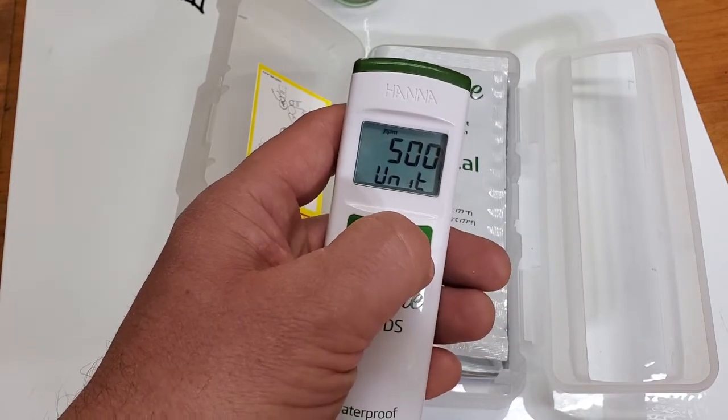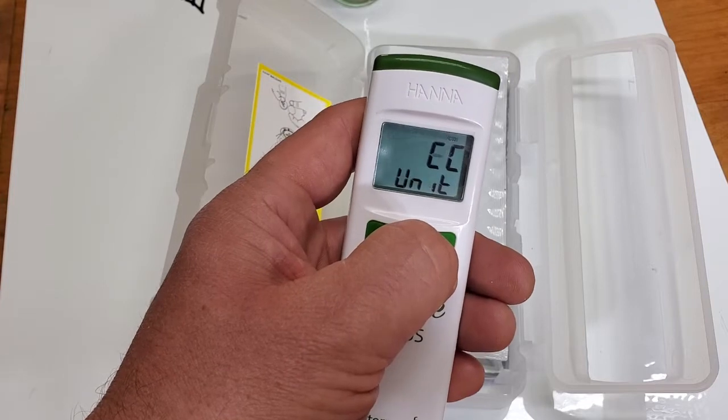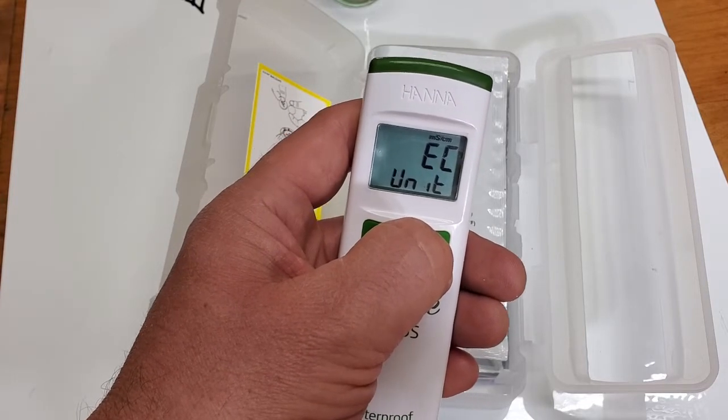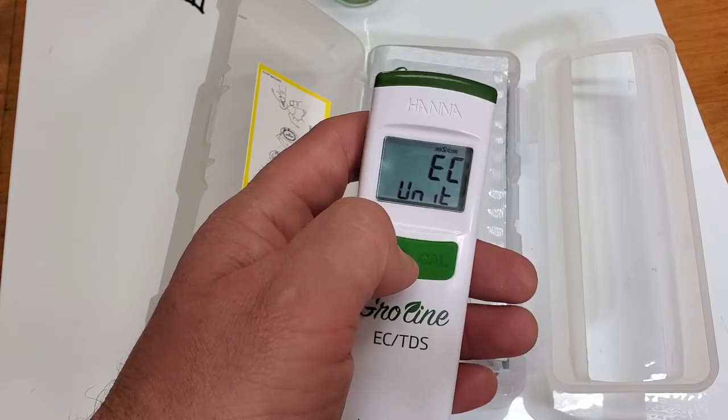You can change the units between parts per million at the 500 scale, the 700 scale, or EC which is given in millisiemens — which is the best scale to use. It's the most universal.